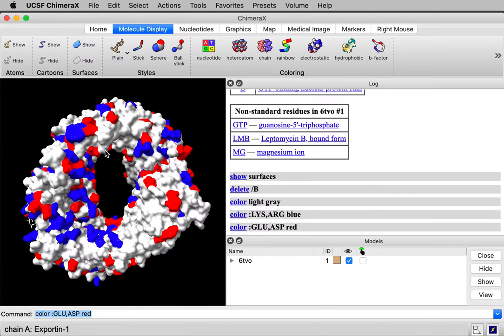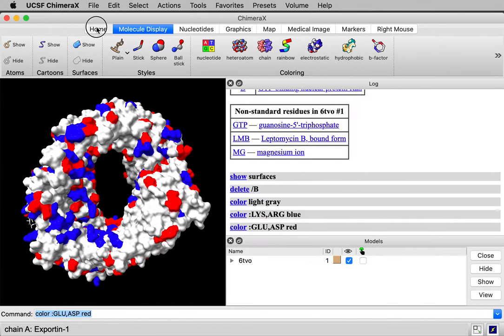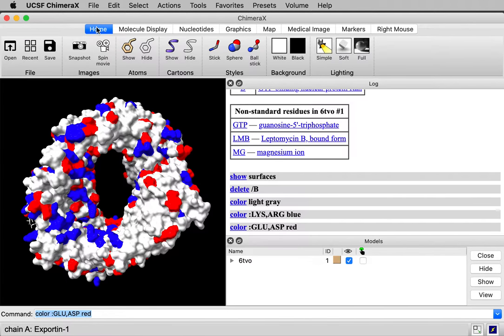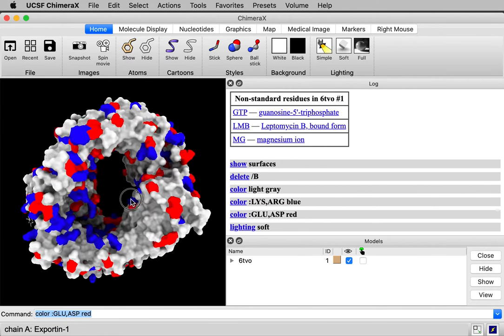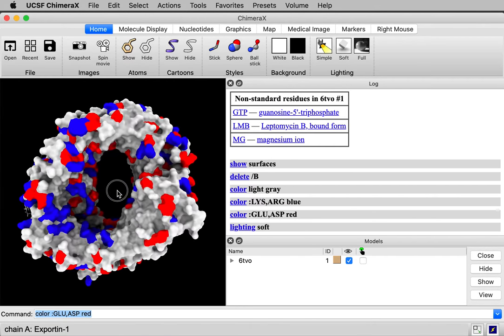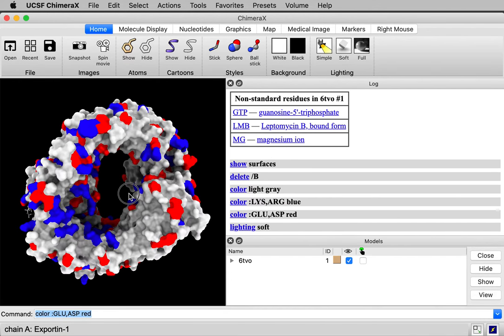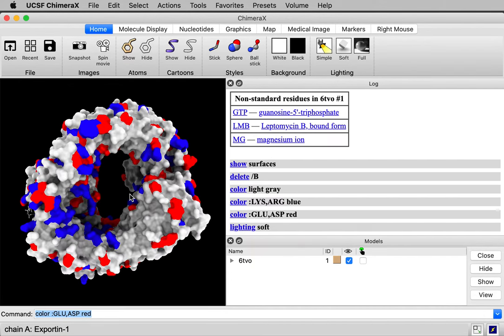One way to make this look a little bit nicer, a little more three-dimensional, if I go back to the home toolbar, this lighting, this soft lighting will cast shadows and just gives a more three-dimensional appearance.